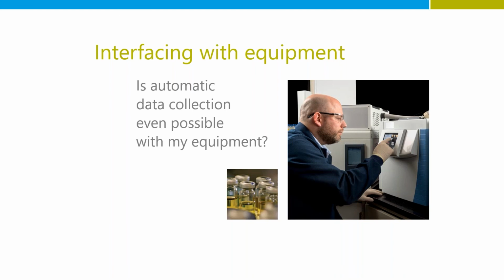Some of them will not have easy connections, or they might have proprietary connections to do so. So some equipment doesn't play well with others. There might be a vendor that has a machine and they expect you to interface with XYZ product. So there might be a few ways around that.